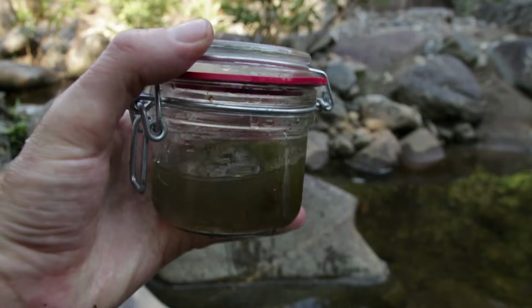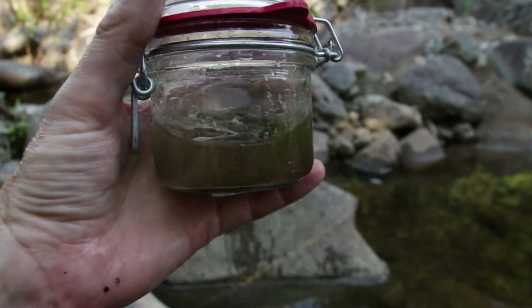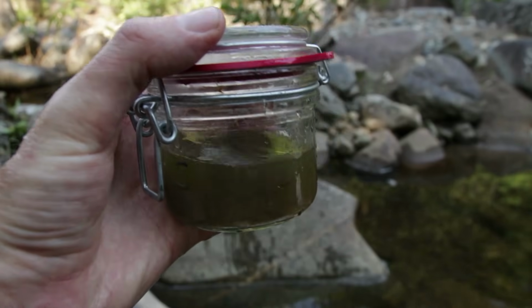So there we go, we have our sample. Bit of a mess in there, there's a couple of tadpoles and just a lot of goop down in the bottom. Plenty of green stuff. And let's take that back to the lab and have a closer look.